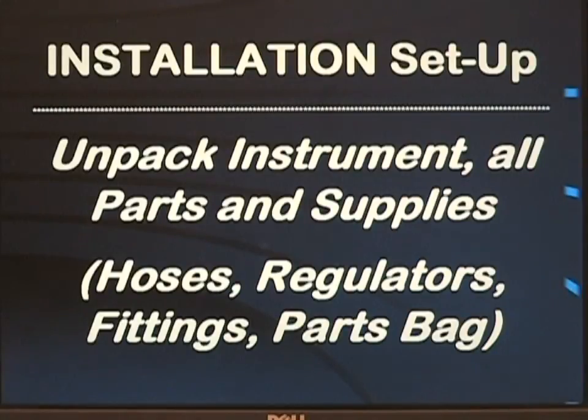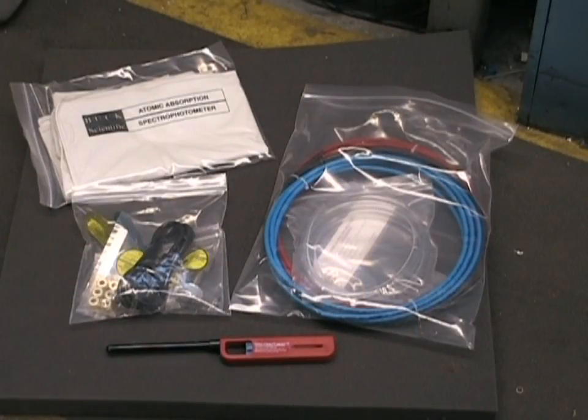When you receive your instrument, unpack it and lay out all of the parts and supplies such as the gas tank regulators, connecting fittings, tubing, drain hoses, and spare parts. The basic installation kit will include a dust cover for the instrument, a bag with a series of quarter-inch swage lock fittings, a series of hex wrenches for removing the burner head and drain block, power cable, and some nylon tubing for the gas lines and Tygon tubing for the drain line. Ignition of the flame is accomplished with the barbecue lighter enclosed with the installation kit.